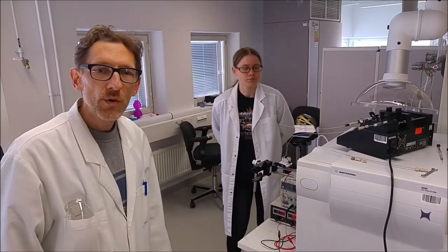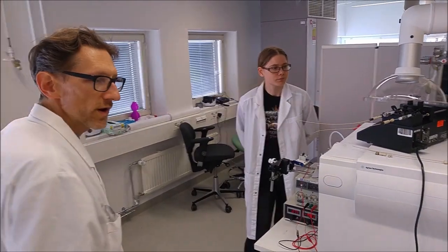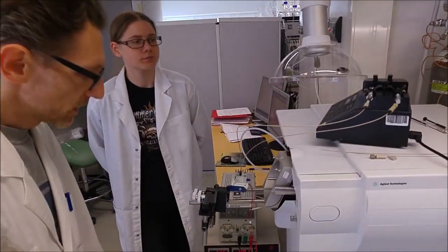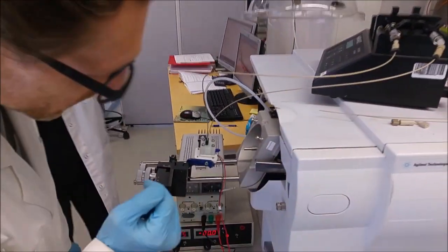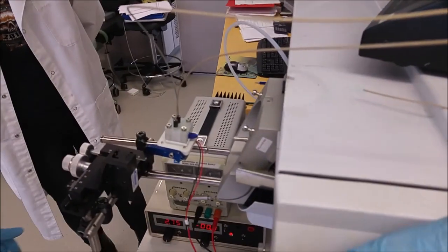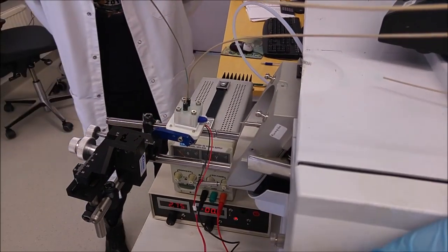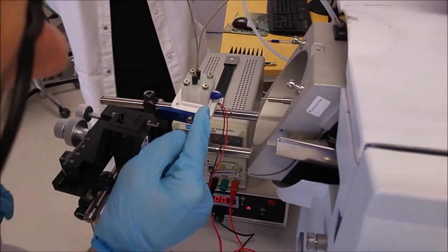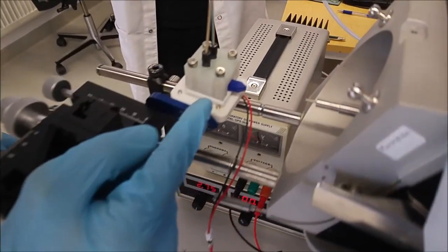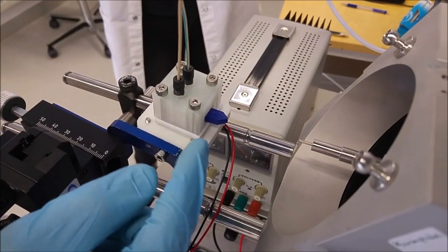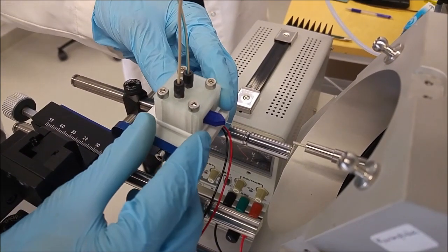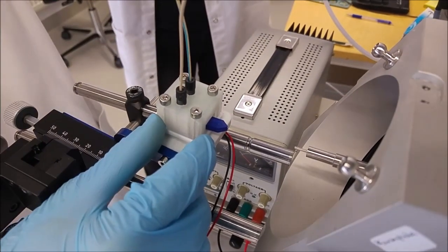We are now in our mass spectrometry lab where our experimental setup is. Here you see of course our mass spectrometer. It is an ion trap. And attached to it is our micro-reactor.